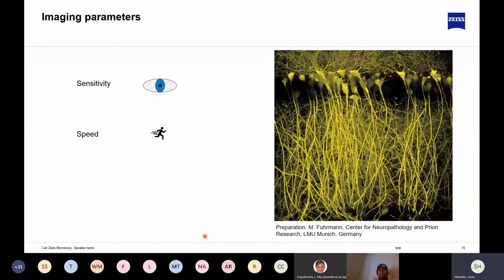And then imaging techniques and sample preparation become a very strong discussion as well. So the sample thickness or the size of your sample should also be considered if you're looking at a whole brain slice or a single cell, and whether you're looking at stuff at the cell walls versus very deep into your sample.